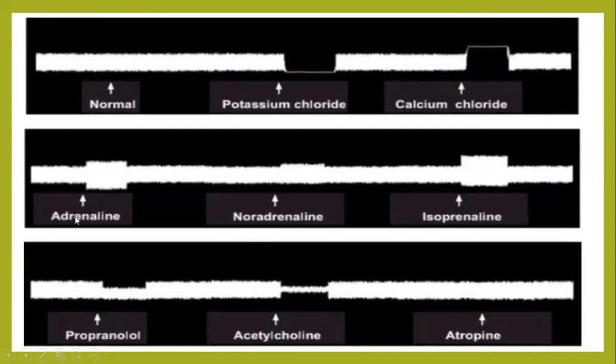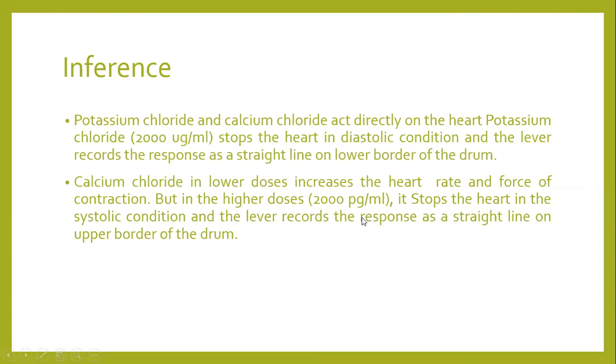Okay, so adrenaline. Now apply this logic over here. Adrenaline increases both the systole as well as the diastole. We are also using noradrenaline, isoprenaline, propranolol, acetylcholine, and atropine. We have to take out the inference from this graph, and this inference we are going to discuss in detail in the next slides.